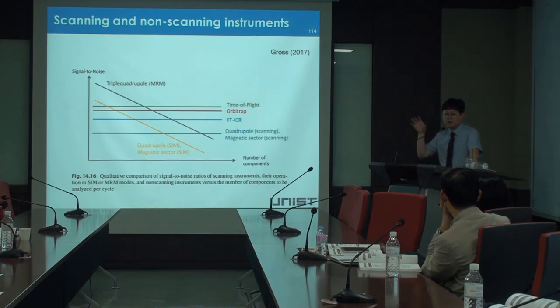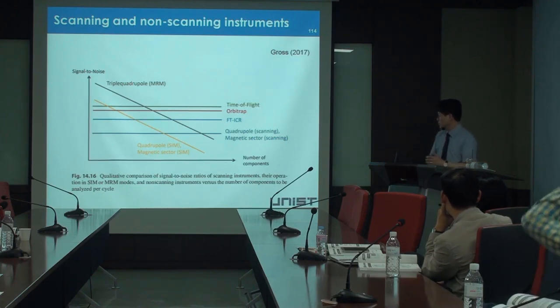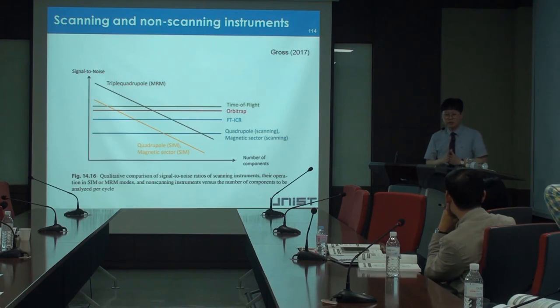It means selected ion monitoring, SIM. I didn't explain it previously, but this is very important for POPs analysis. We have the exact molecular weight. We input this information to the MS, and then this instrument only analyzes our target chemical. Okay? This is SIM mode. For scan mode, quadrupole scan and also full spectral scan means analyzing everything.